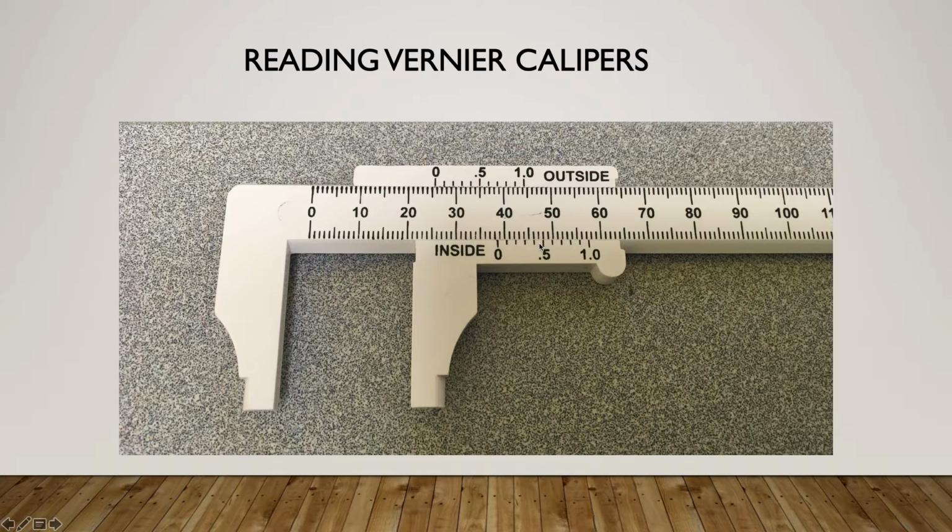And this kind of gets us to this whole idea of how accurate our measurements are with things like significant digits. If we were actually going to record this measurement to use for our lab, we would say this is 25.4 millimeters. And again, that very last decimal of a measurement is always going to have a little bit of uncertainty in it because it's kind of an estimation. And so that's why I say whether you put a 4 or a 5 there, it doesn't really matter all that much, because that last decimal place is the one that, if there's going to be any error, is going to be a little bit different. So there's always a little bit of leeway on that last decimal place.